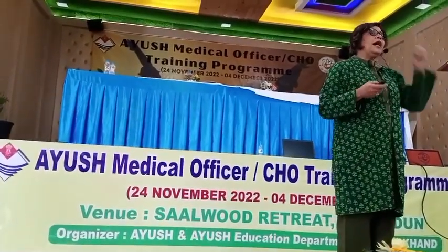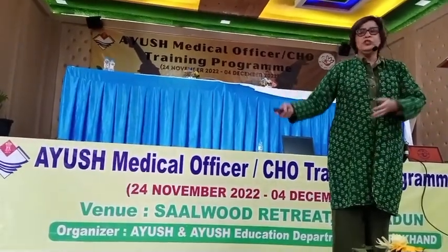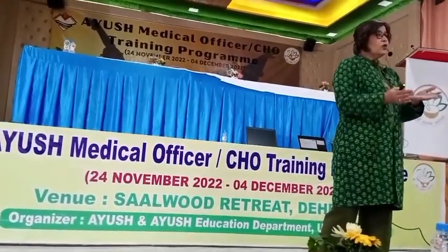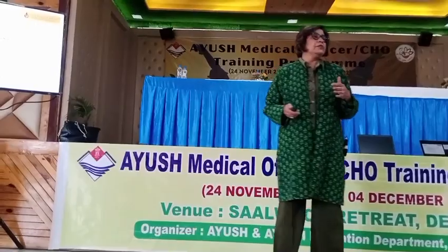So first of all, identify the patient that you're taking the sample from. Small children may come, two or three of them, and all three have a test, and you have matched the wrong sample to the wrong patient. Then check the pre-test requirements.